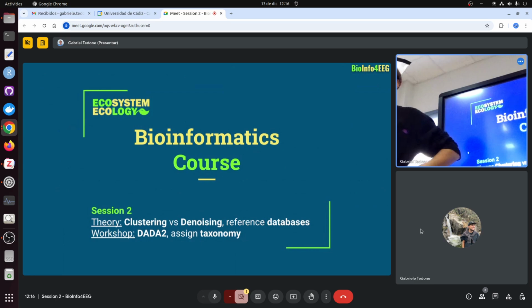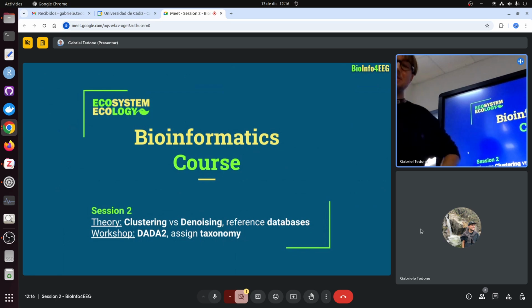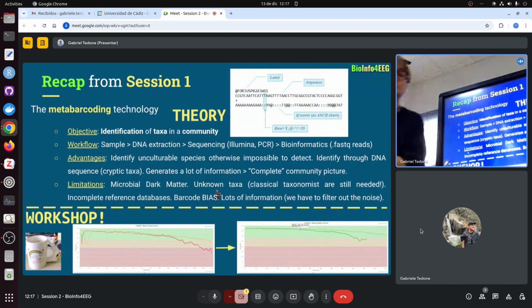Welcome to the second and maybe the last session in some time of this bioinformatics course. In this session, we will talk about the clustering versus denoising processing of sequencing reads for metabarcoding analysis. And we will talk and see some reference databases. And the workshop we won't do today, we'll do probably next week in Petit Comité.